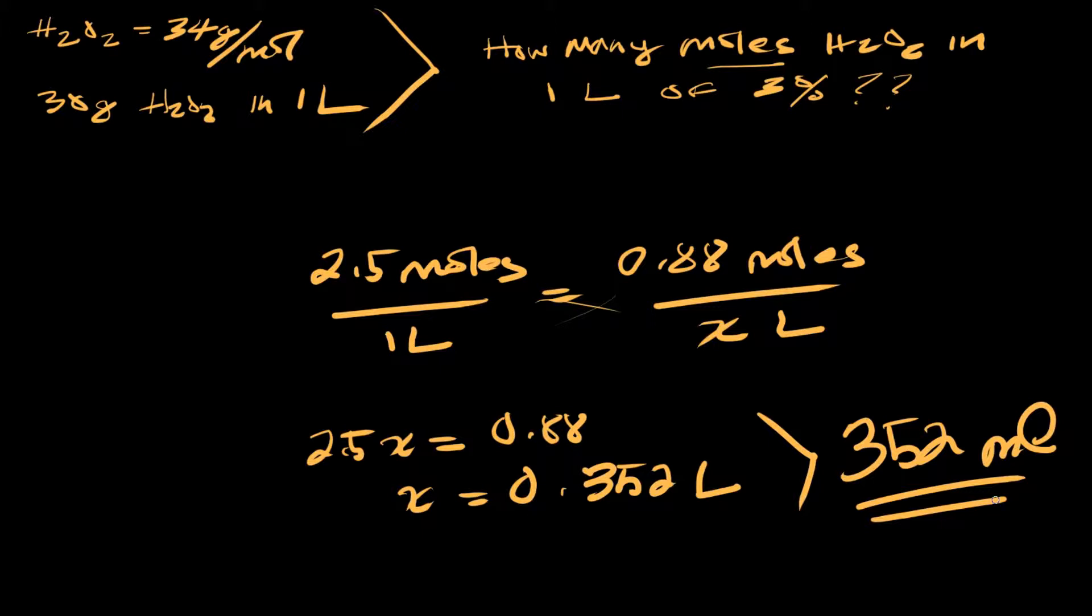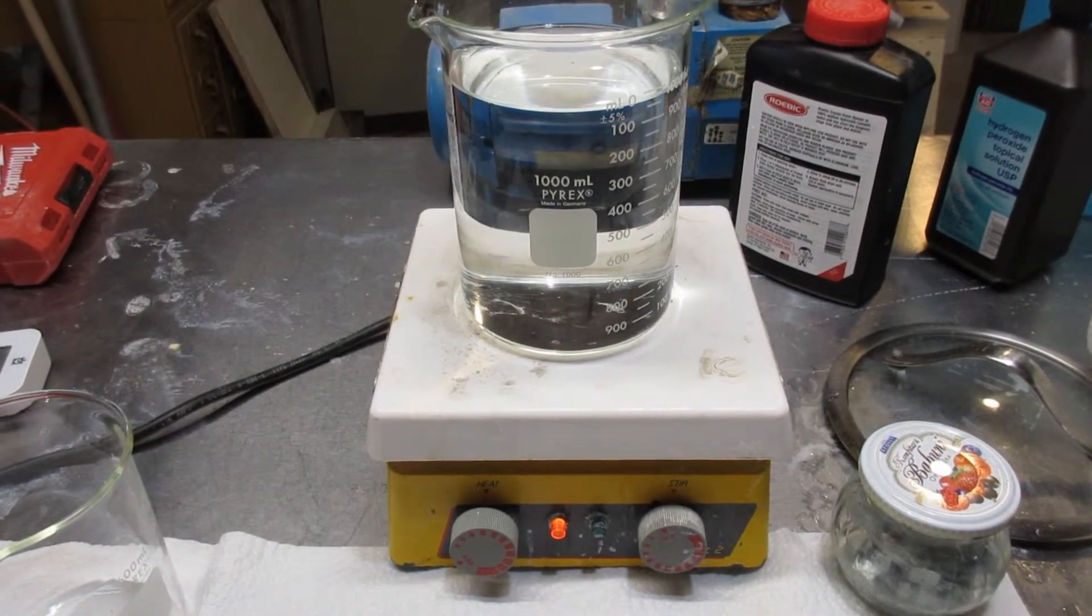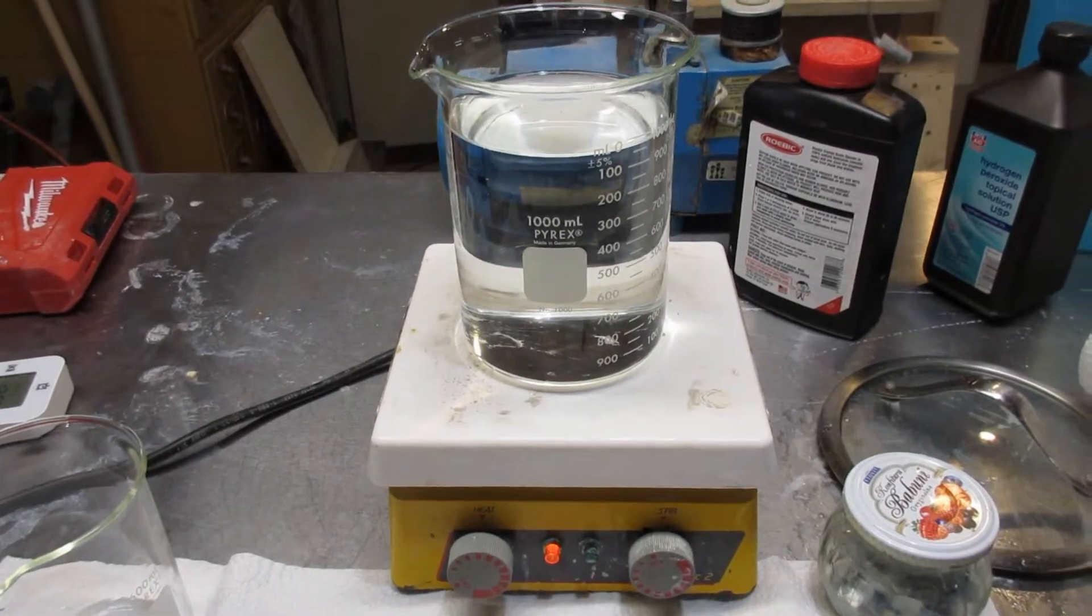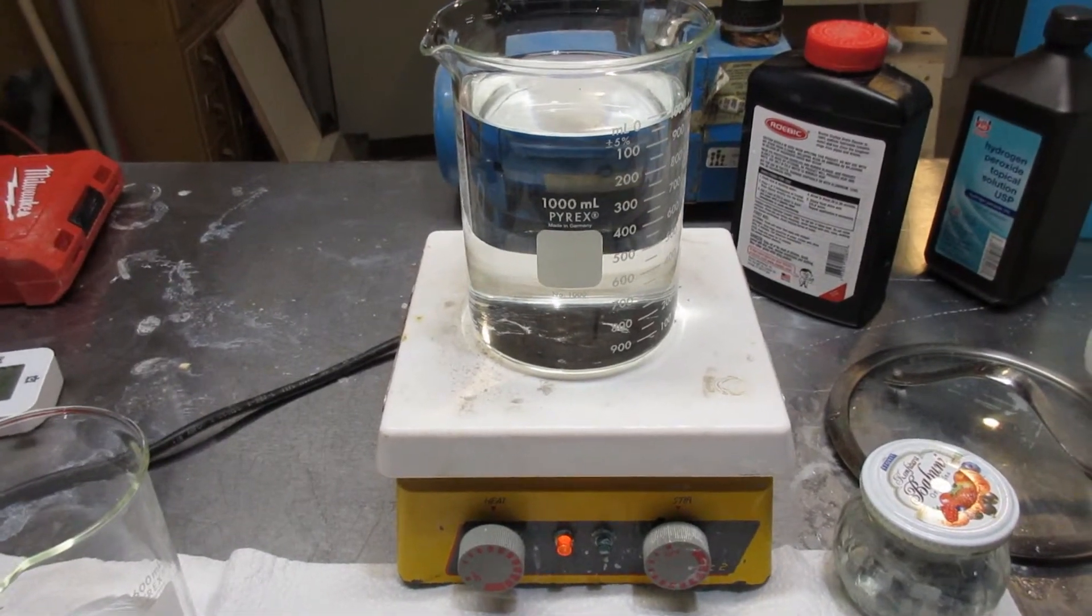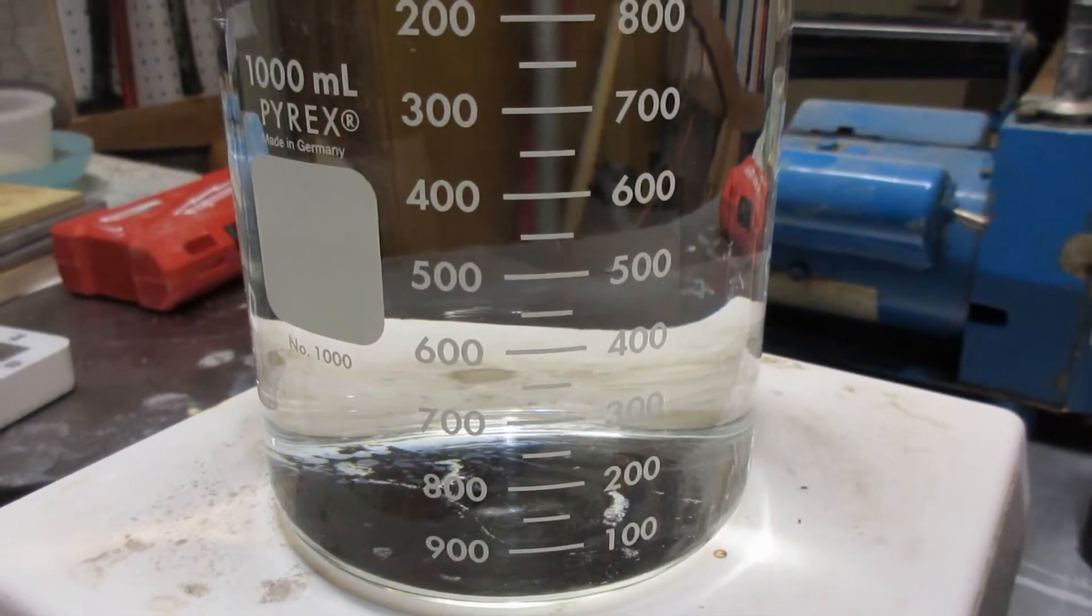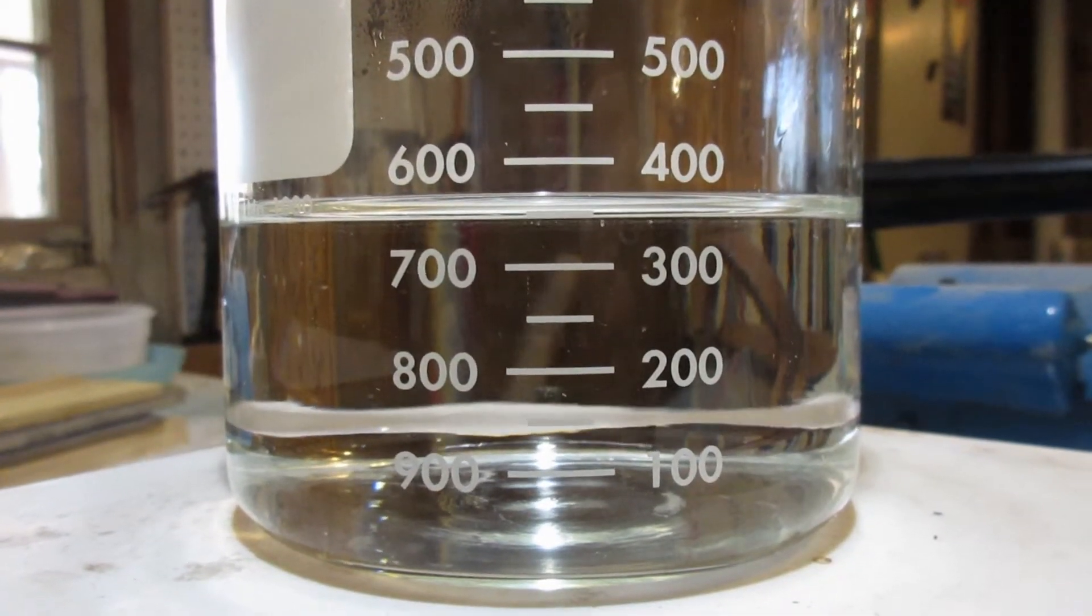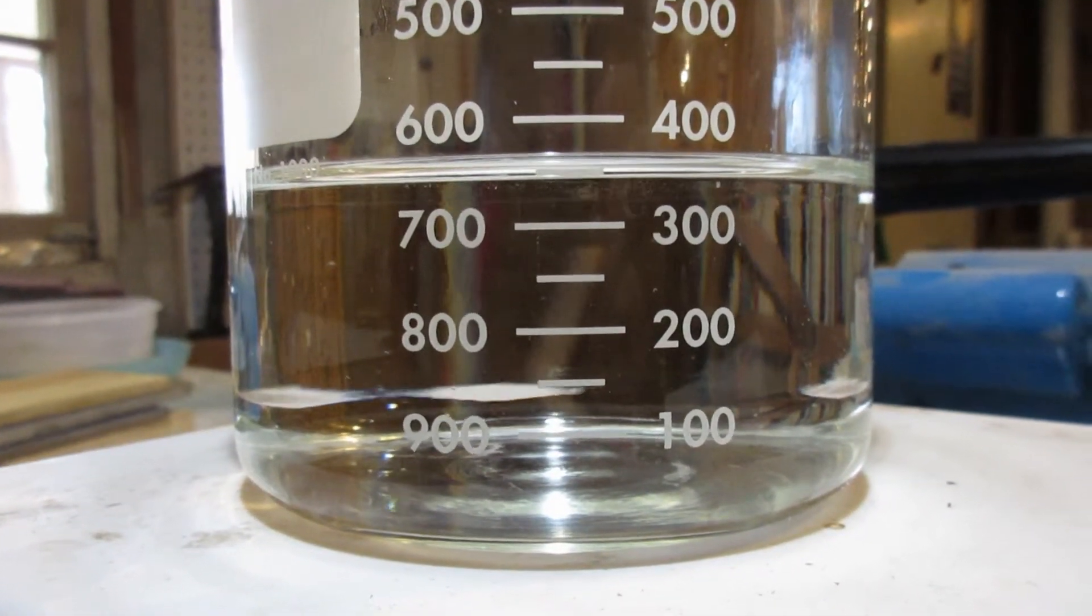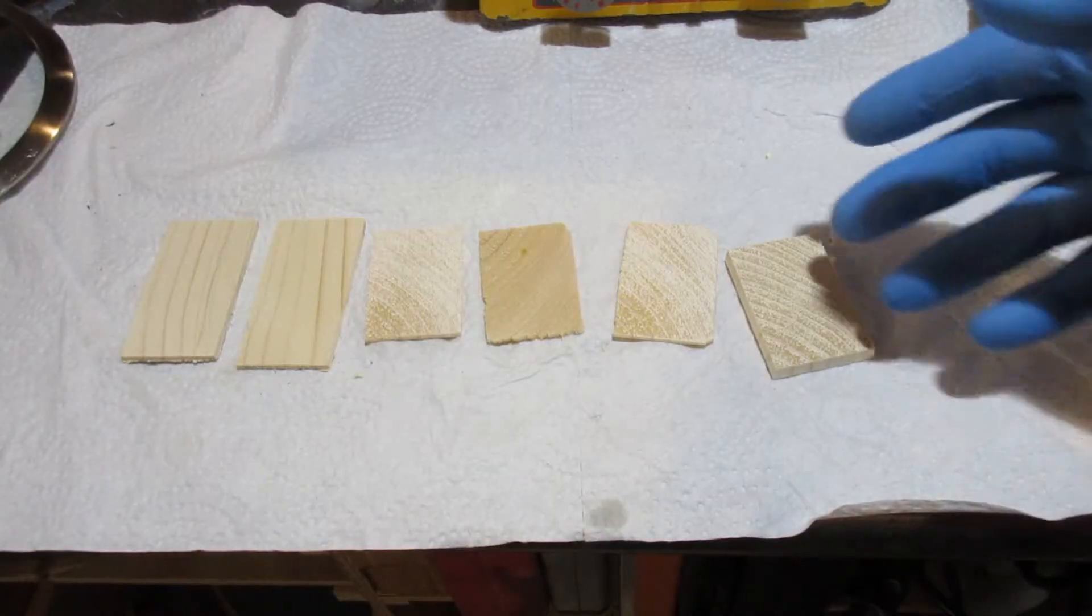There's our one liter of hydrogen peroxide. We want to slowly evaporate that—you don't want to boil it because that can decompose some of the hydrogen peroxide and you won't end up with what you want. So you want to do it nice and slow. We'll ease that down to 350 mils and that'll give us our 2.5 molar. There we go: 350 mils of 2.5 molar hydrogen peroxide right on the nose. Remember, read the meniscus. And you'll probably want to wear gloves when handling this—it's a pretty good oxidizer.